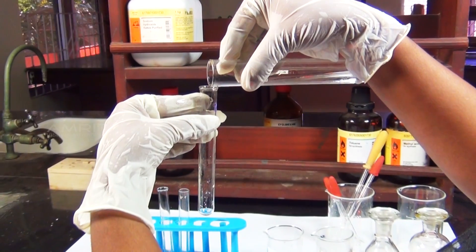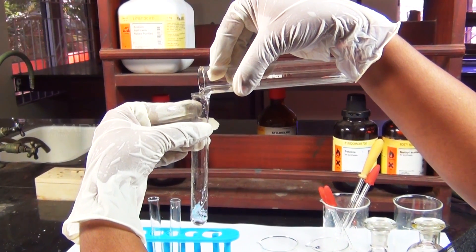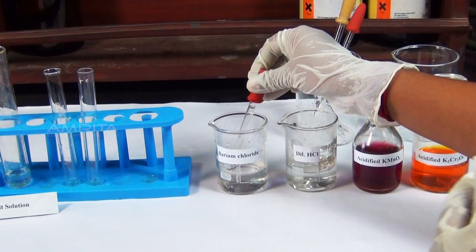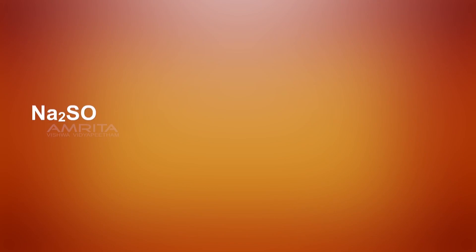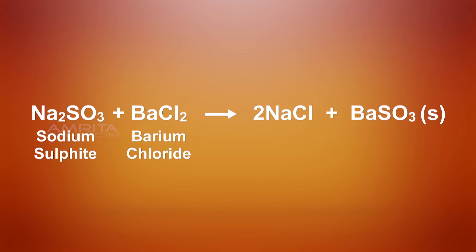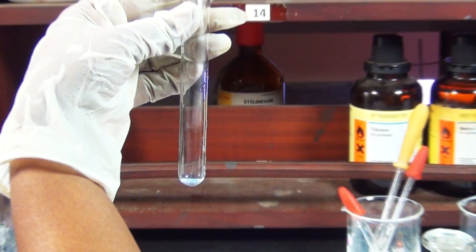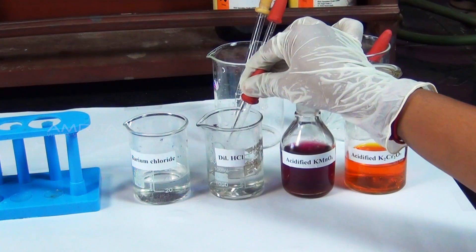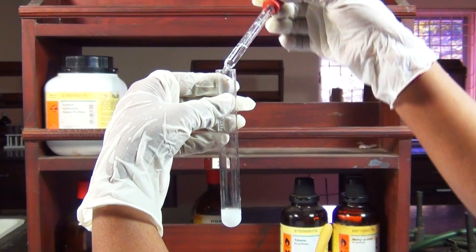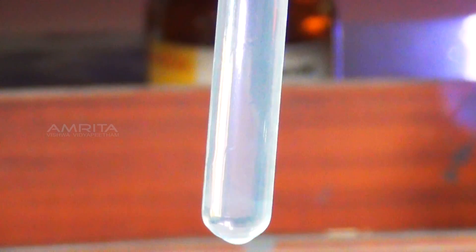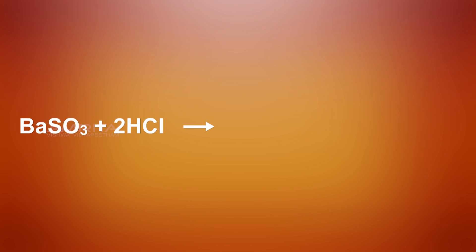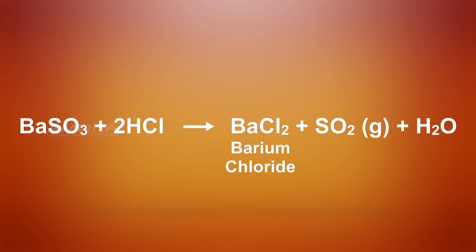Procedure: Take a small quantity of aqueous solution of the salt in a test tube. To this, add a small amount of barium chloride solution using a dropper. Sulphite reacts with barium chloride to form a white precipitate of barium sulphite. Take a portion of the precipitate in another test tube. To this, add a small amount of dilute hydrochloric acid using a dropper and shake the test tube. The precipitate of barium sulphite dissolves in dilute hydrochloric acid to form soluble barium chloride and evolves sulphur dioxide gas.